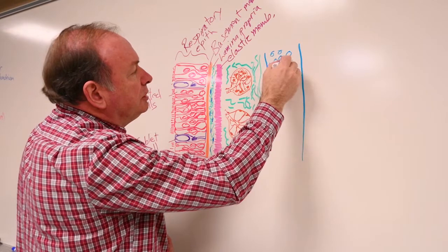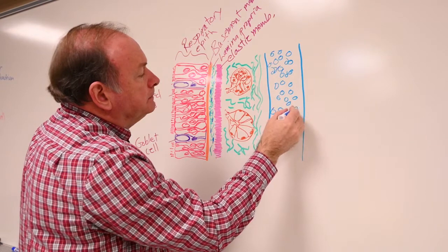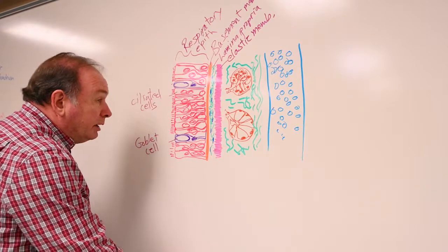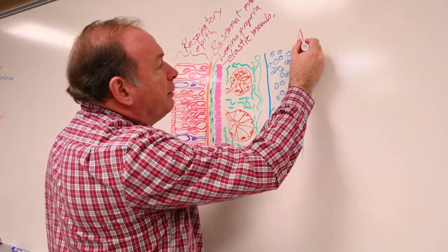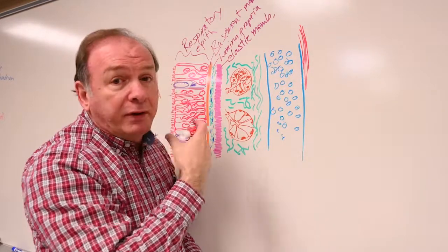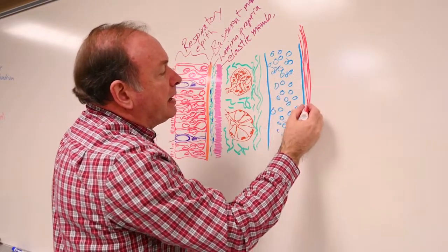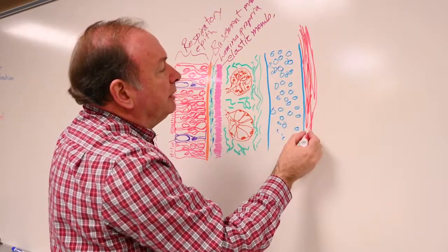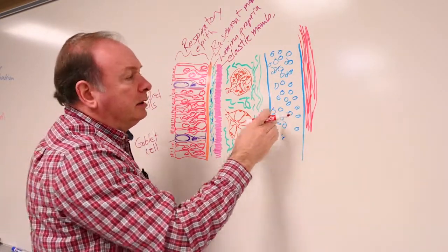Hyaline cartilage. Now there may be some smooth muscle to the outside of that depending on where you cut it. There may not be any cartilage in the very back of the tracheal structure. The ring of cartilage doesn't join in the very back of the trachea. But anyway, here we'll put a little smooth muscle in right here. I always refer to this as the cartilage muscle layer.